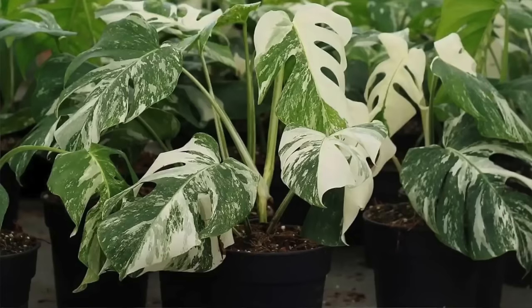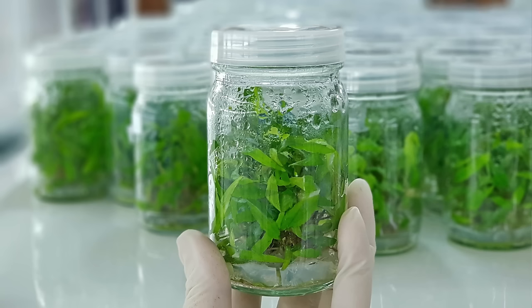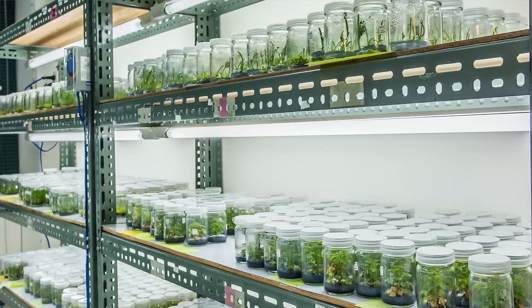Tissue culture allows you to create massive quantities of genetically identical plants from one very small piece of plant tissue, or even a single cell. You can basically create infinite plants and keep cloning them over and over. You could create a million plants if you wanted to. The power is yours.